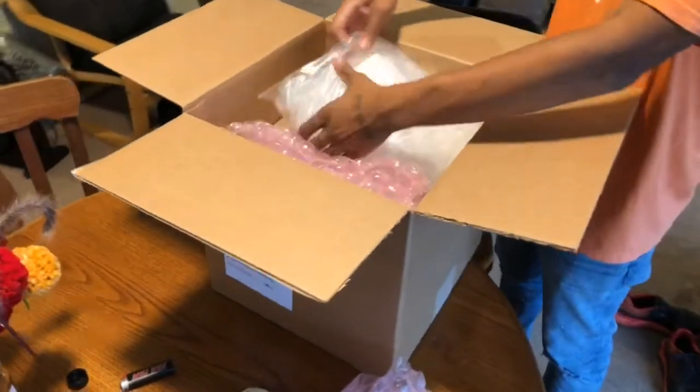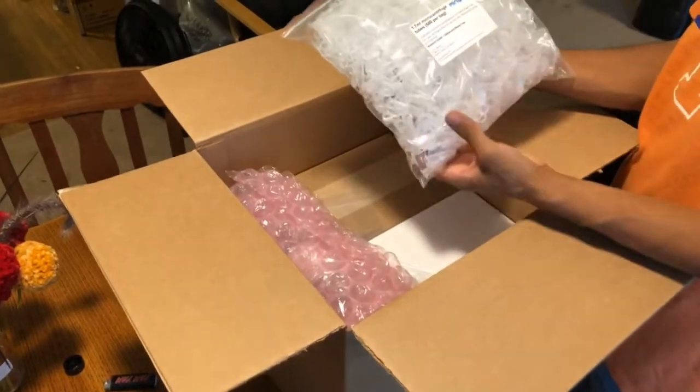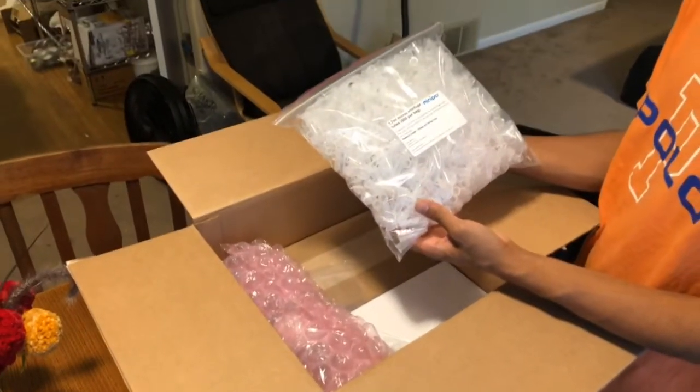All right, so the first thing we got in here: 500 1.7 milliliter micro centrifuge tubes.